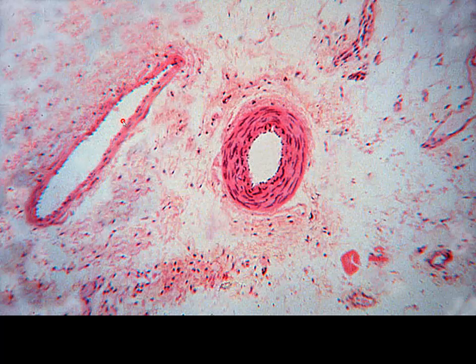But again, we're looking at the diameter of the lumen versus the thickness of the wall of the vessel. Again, we can see intima, the muscular layer of the tunica media, adventitia on the outside. Here we have a much larger lumen than we do thickness of the wall and adventitia. So this is still going to be a vein, and this is still going to be a muscular artery, because even with this we can count upwards of 6 to 10 layers of smooth muscle.